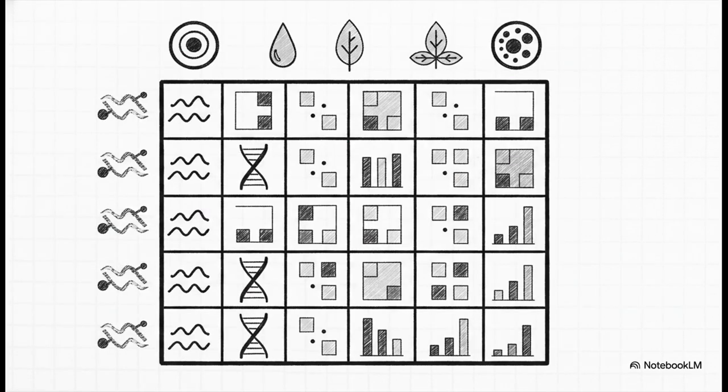And boom, here we are. We've officially reached the destination. Once our abundances are quantified and normalized, we pack them into a tidy little count matrix. It's a beautifully simple setup. All of our specific genes span the rows, and all of our different biological samples span the columns. This one matrix is the absolute bedrock foundation for any downstream biological analysis we could ever want to do.